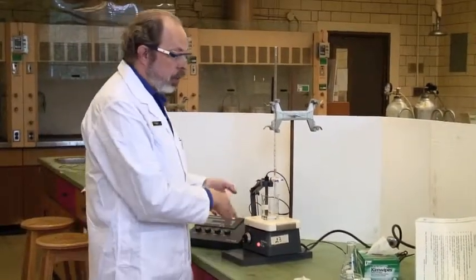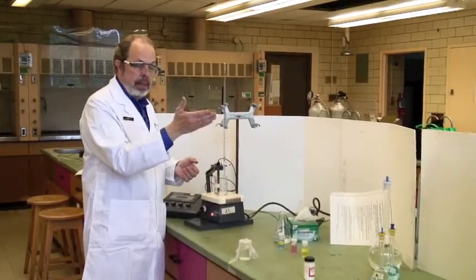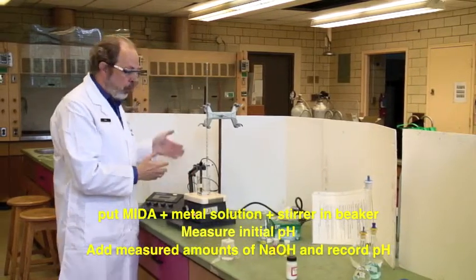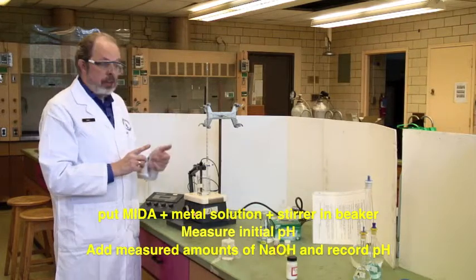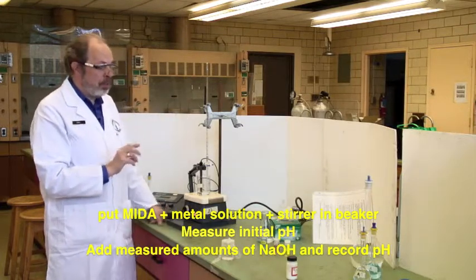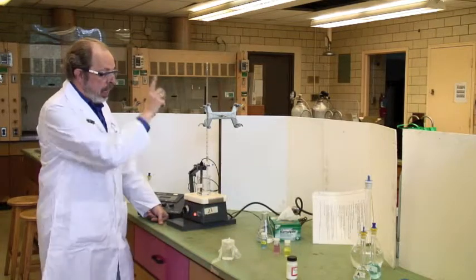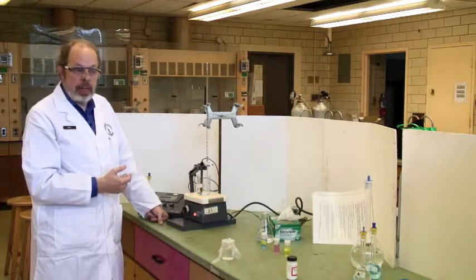When you finish the first titration, discard the material. Add more MIDA and some metal solution. Read the pH before adding any sodium hydroxide—you need that number. Then add sodium hydroxide progressively and monitor the pH.